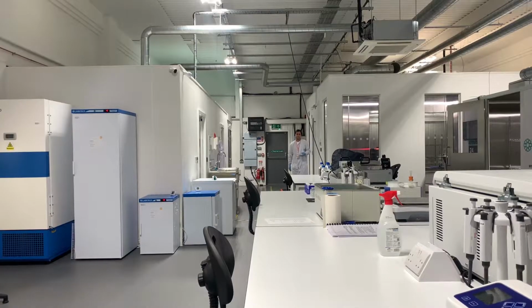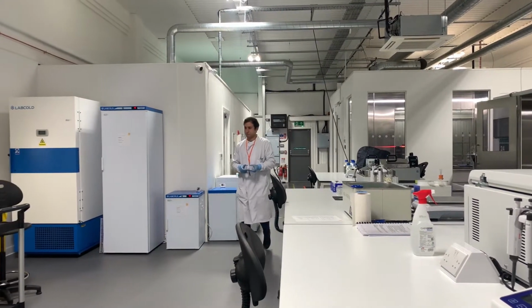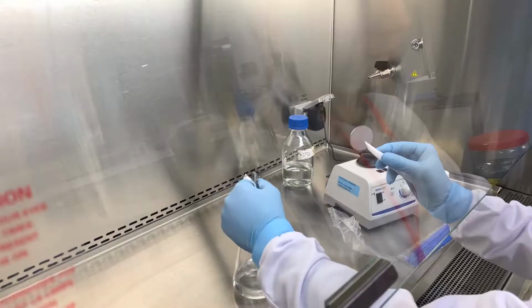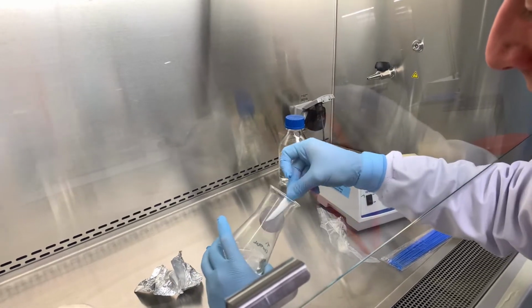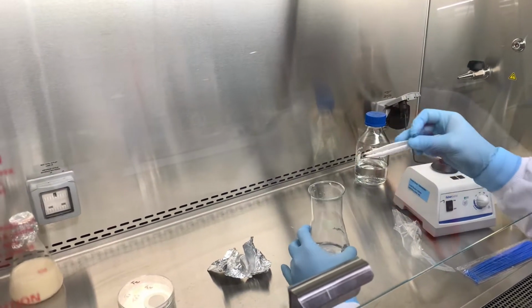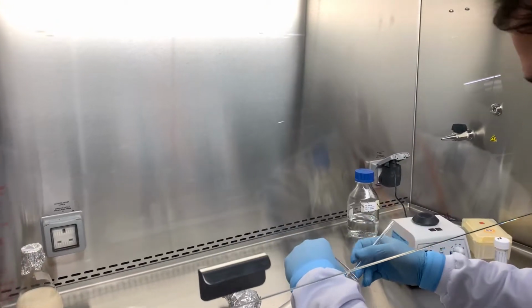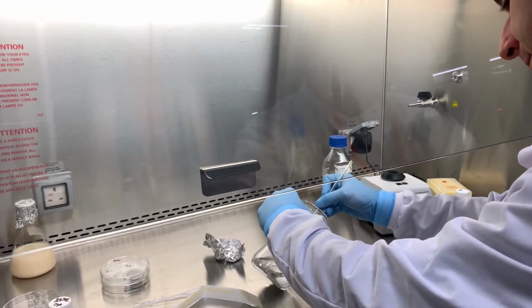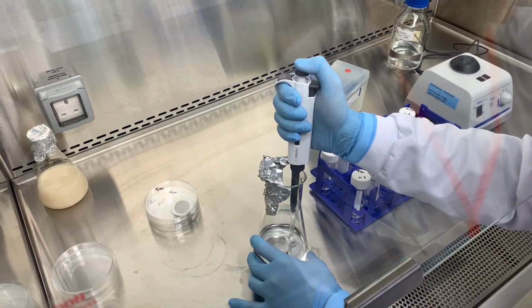Once the decontamination process has ended and it is safe to enter, the exposed and unexposed test carriers are placed inside a sterile petri dish and transferred inside a Class 2 safety cabinet. Here, the carriers are transferred into a 250 ml sterile flask containing 100 ml of recovering liquid medium. The carriers are then scraped off using a sterile pipette to dislodge all surviving cells into the recovering medium.